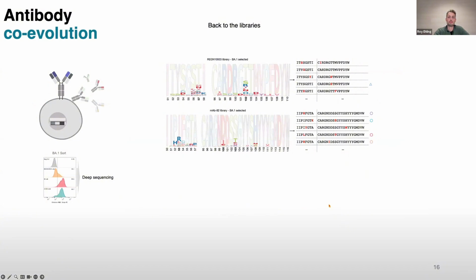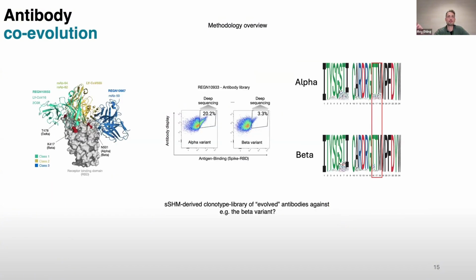So what I just mentioned to you is essentially the first round of evolution, so to speak. It's kind of a cheap way of looking at it, but essentially we exposed that specific clonotype, were it to exist in a germinal center, to an antigen, a repeat exposure, and it would now start to form affinity matured variants towards it. So this is the first synthetically SHM clonotype library.